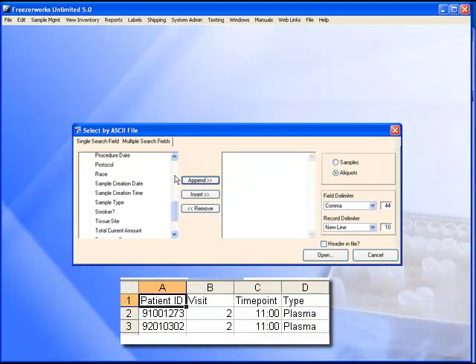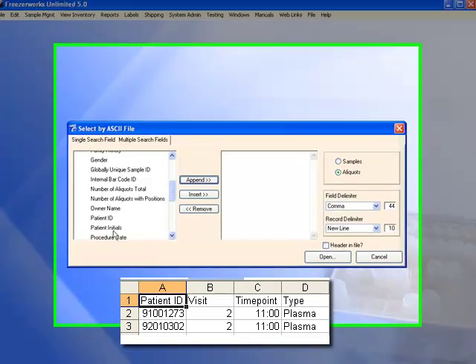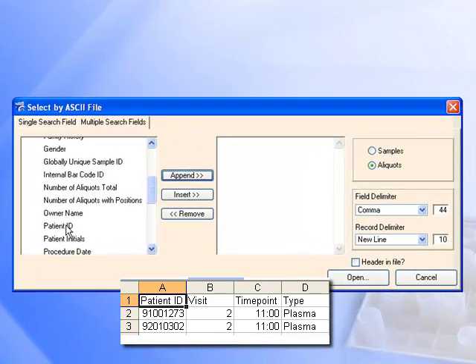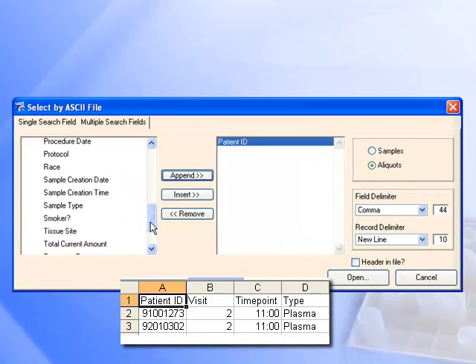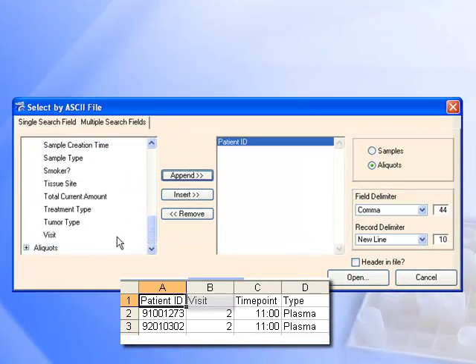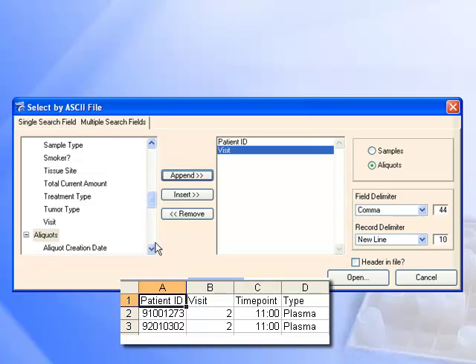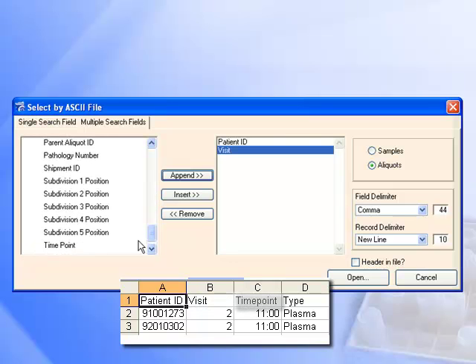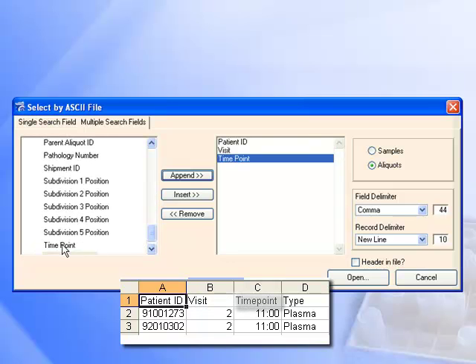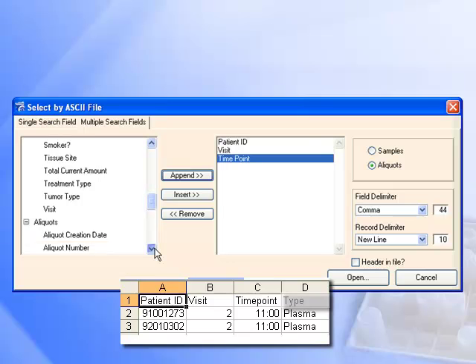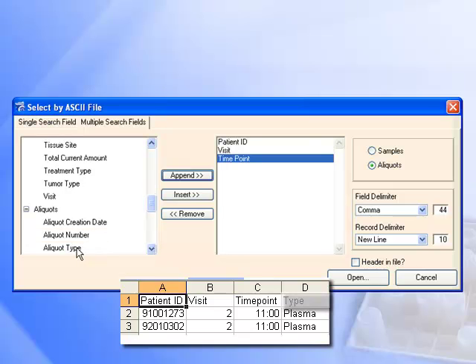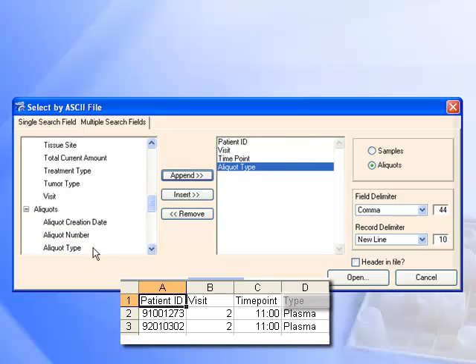Here they are. Patient ID, Visit, Time Point, and Aliquot Type.